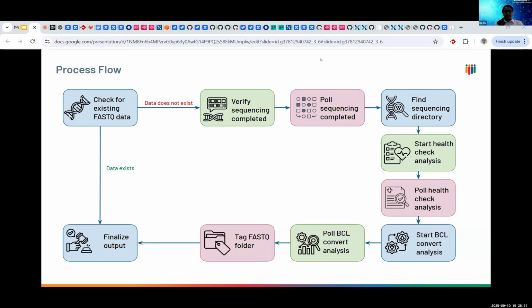All the steps that I have mentioned run automatically one after the other. If something goes wrong, for example if a step fails, the state machine is configured to retry or flag the error appropriately. Let me give you a small example here. While finding a sequencing directory, it can go in multiple ways, right? You may find a sequencing directory, you may not find it, or you may find multiple folders or any other kinds of error. So the state machine can be configured in different ways.